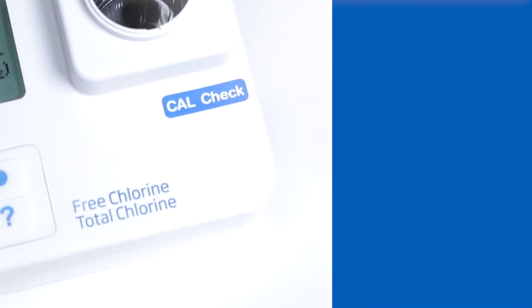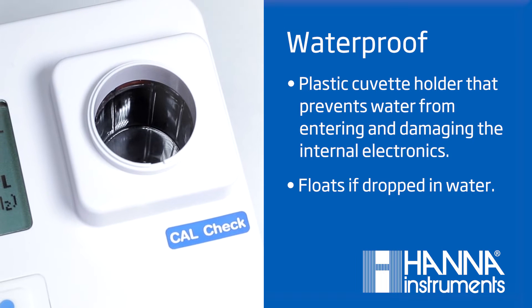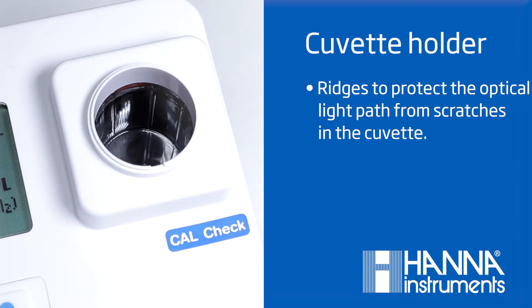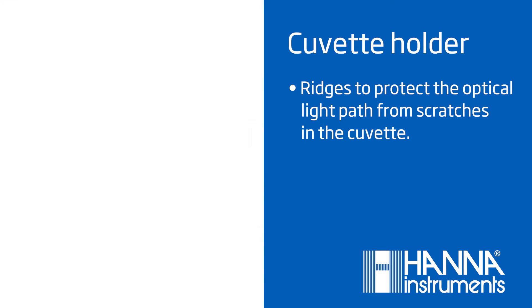This meter is completely waterproof due to the plastic cuvette holder that prevents any water from entering the meter and damaging the internal electronics. The cuvette holder is made with ridges in order to protect the optical light path from scratches from the cuvette that would otherwise interfere with the measurement.